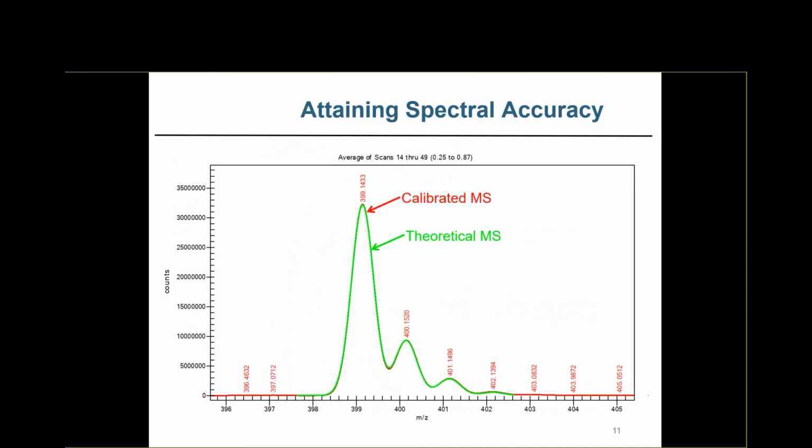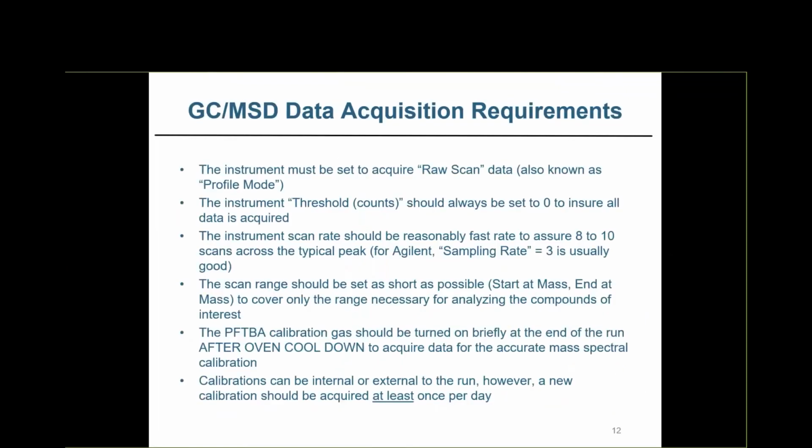And it is actually a very powerful tool. In some cases, it's even more powerful than mass accuracy. So that's our secret sauce in a nutshell. So let's dive into the acquisition requirements.